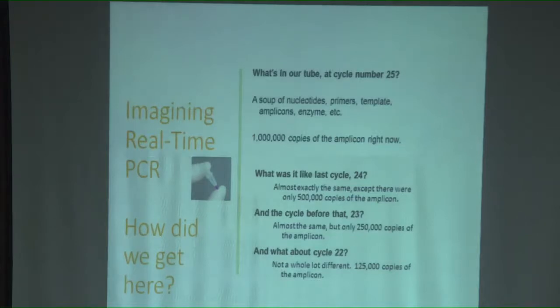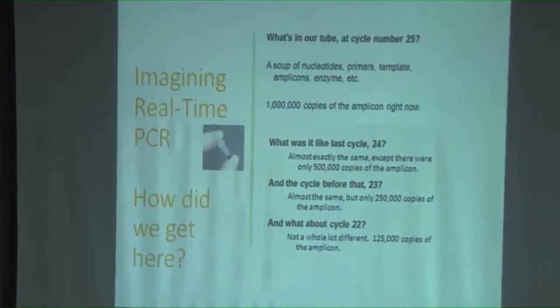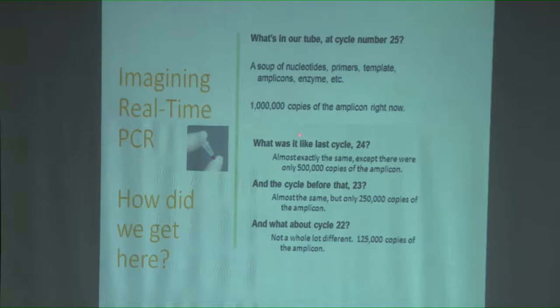Same thing, how do you do in real time PCR? Let us take a hypothetical example. So, the important thing is that now we understand the kinetics. Suppose you see this example, I have started a real time PCR reaction, and at the end of 25 cycles I found there are 1 million copies of a particular DNA which is amplifying. So, at the end of 25 cycles there are 1 million copies. So, how many copies were there at the end of one cycle before, or say 24? It was exactly half of that. Fine, no problem. So, if it was 1 million copies at the end of 25 cycles, it would have been 500,000 copies at the end of 24 cycles.